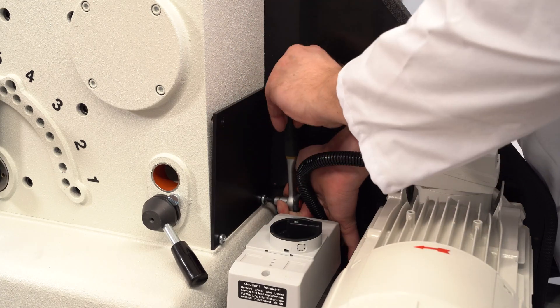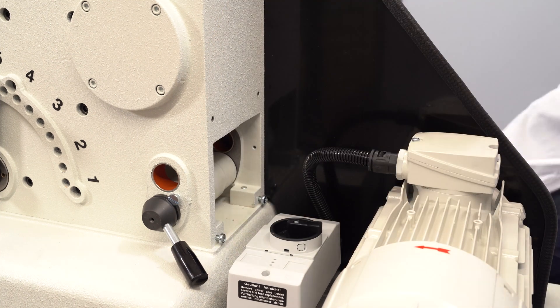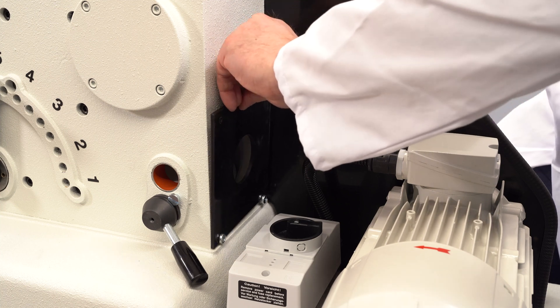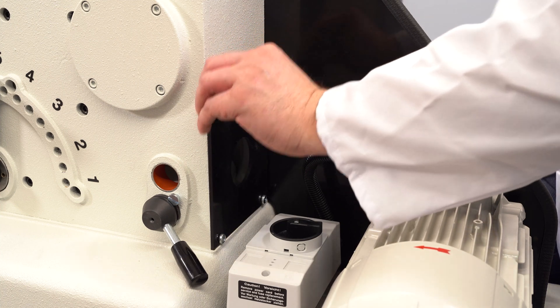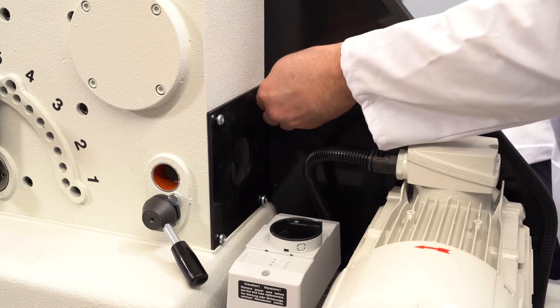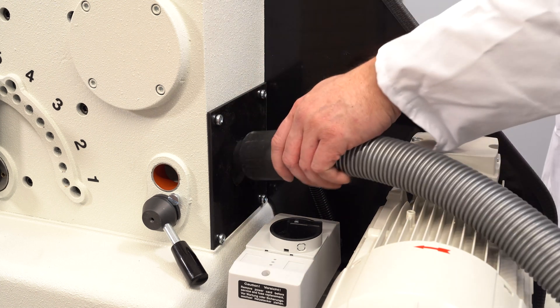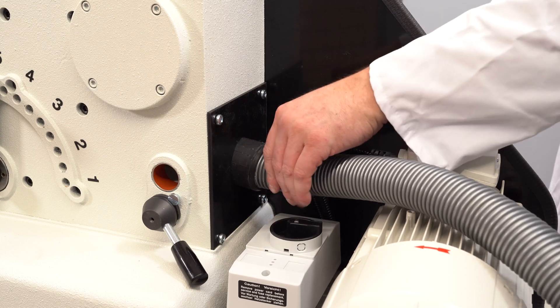There is a possibility to attach a plate behind the grinding chamber where you can connect a vacuum cleaner, so any fine dust coming from the grinding process will be absorbed.